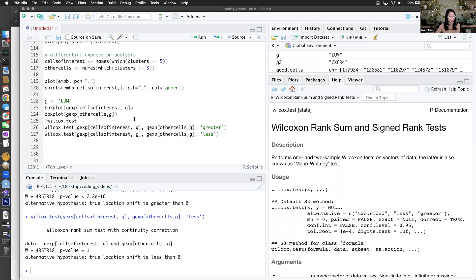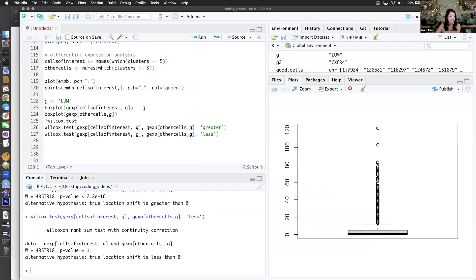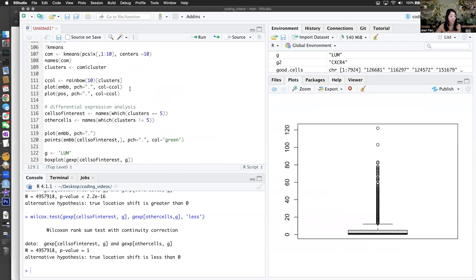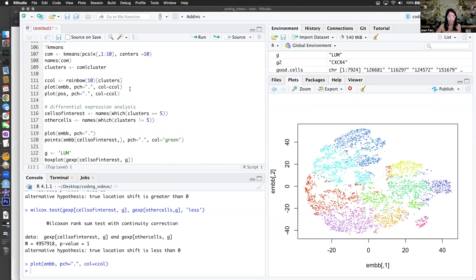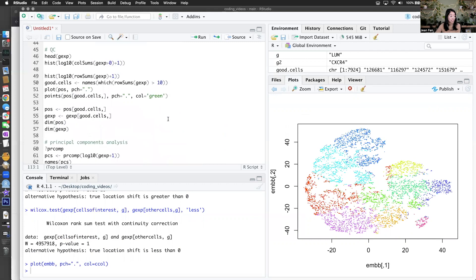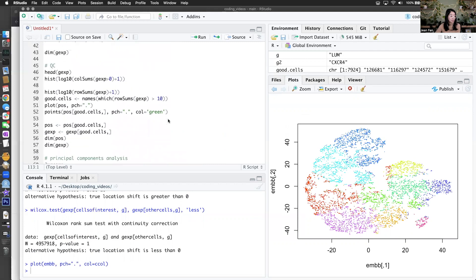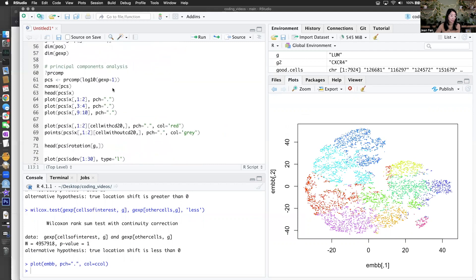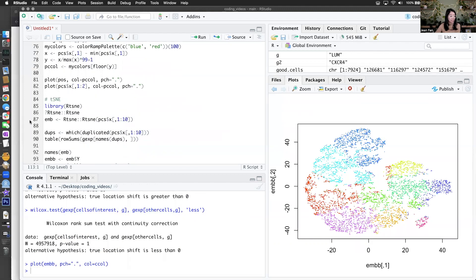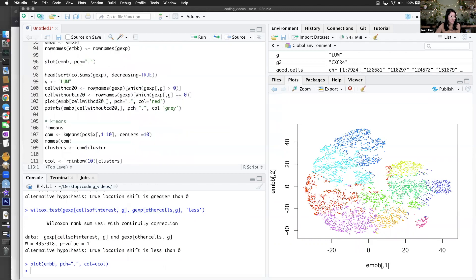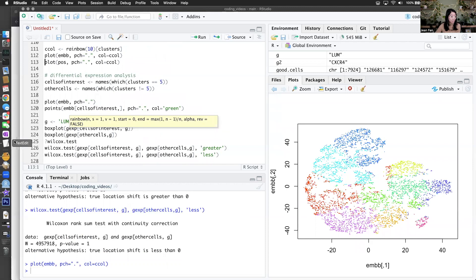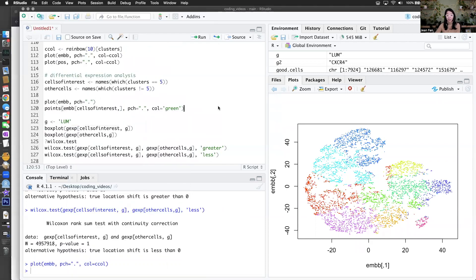It'll be up to the students to learn how to write a loop to loop through all the genes and find everything. But all in all, it looks like we can do some QC, we can do some basic visualizations, we can do principal components analysis, we can do t-SNE, we can do k-means clustering, and differential expression. So I think everything I'm asking the students to do should be feasible.